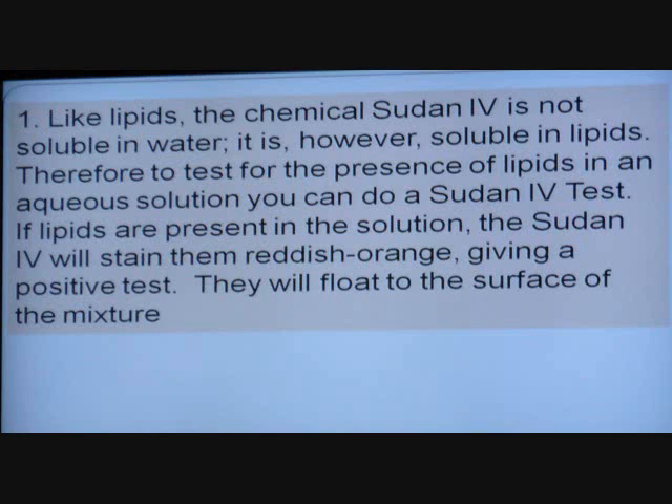I might need to do this again if it doesn't work. The next slide is going to show you the steps I'm going to do, which is not at all what the book says. The book uses filter paper — you draw circles on it, put your sample on, then develop it in a bath. I'm not doing that. Too much trouble, and you waste too much Sudan.